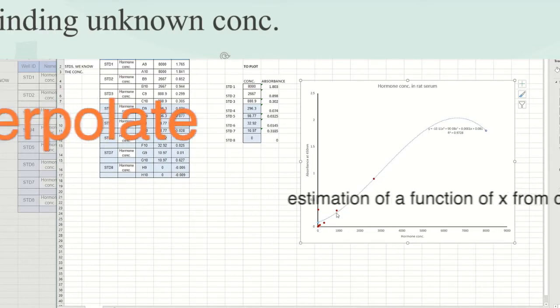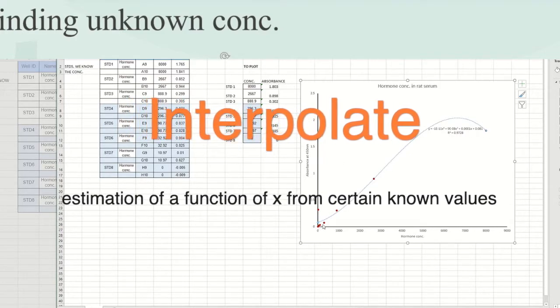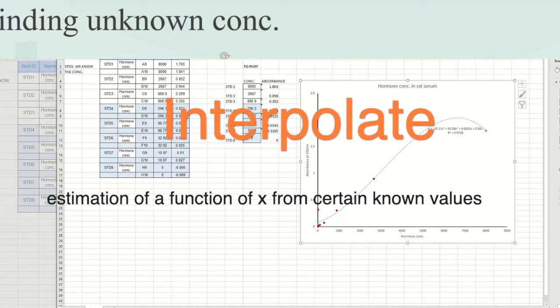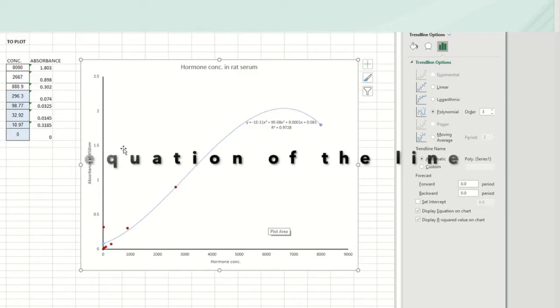So at each given concentration, you're going to have an absorbance reading that correlates to that. You plot it all out, and the best graph to use for such an experiment is a scatter plot. At each concentration you will have a particular absorbance reading. With each absorbance reading correlating with its concentration, what you need to do in order to interpolate, or infer, an amount in your unknown based on the standard curve, is to obtain an equation of the graph that you've made.